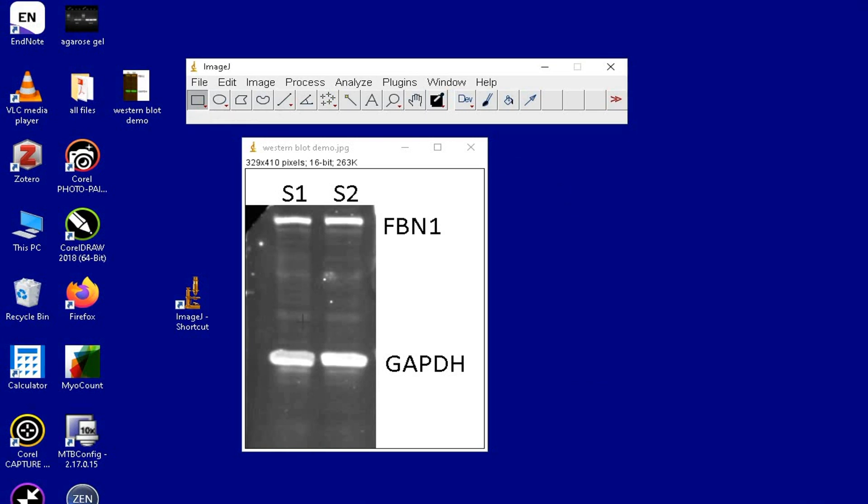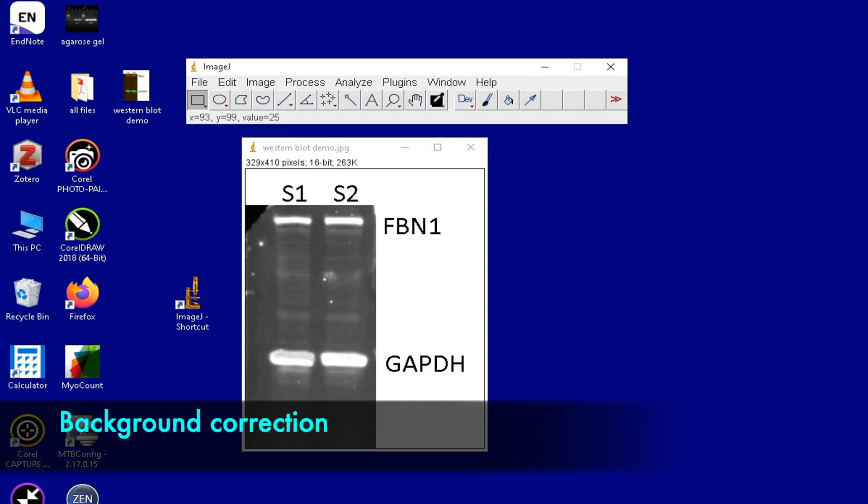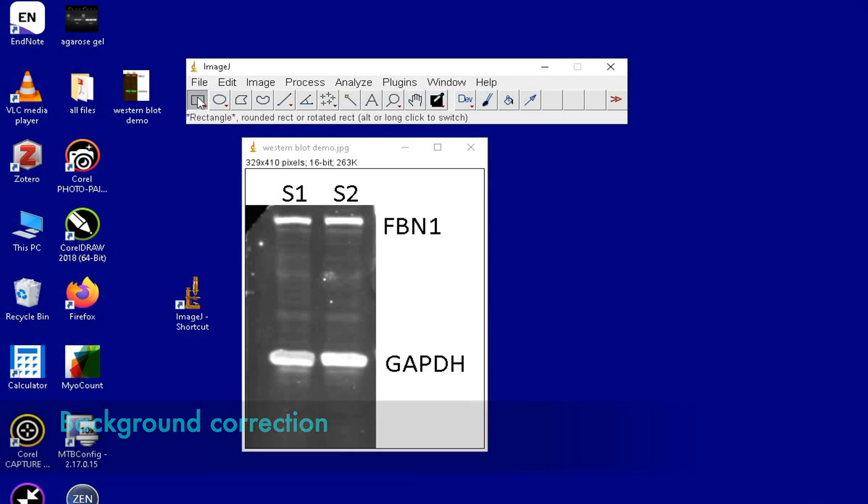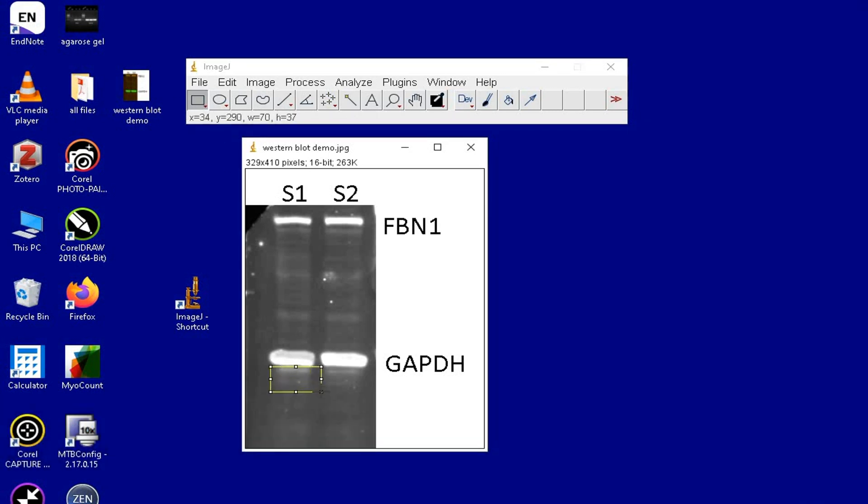The next step is to subtract the background or noise present in the blot. In order to subtract the background, click on the rectangle tool and select the region of interest which is considered as the background to be removed.